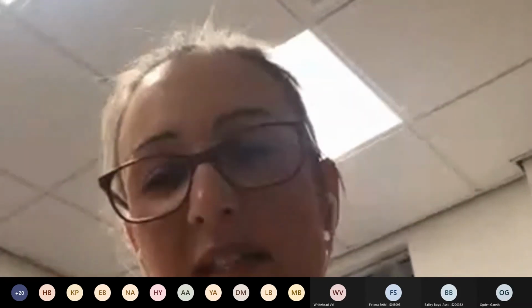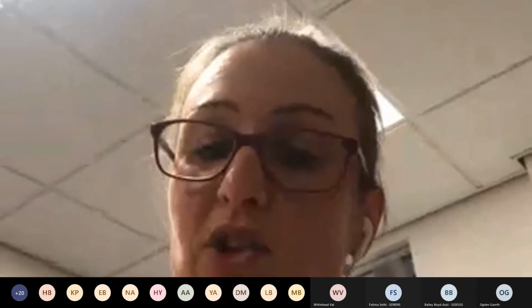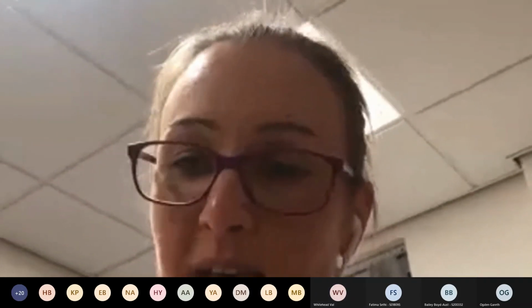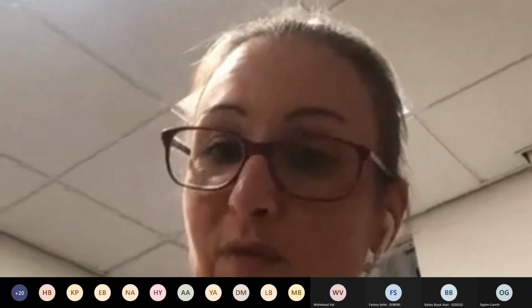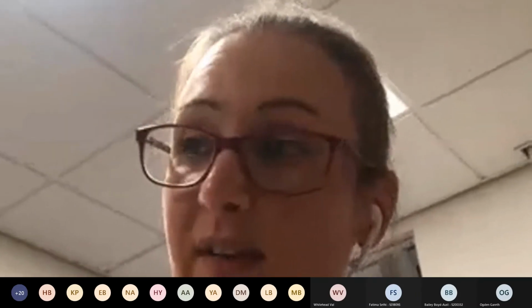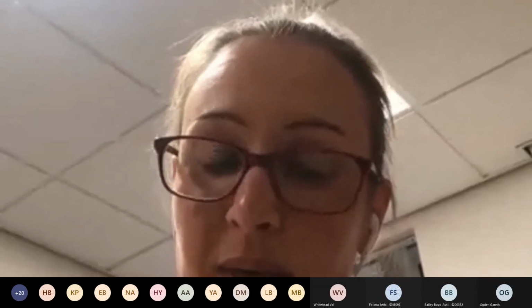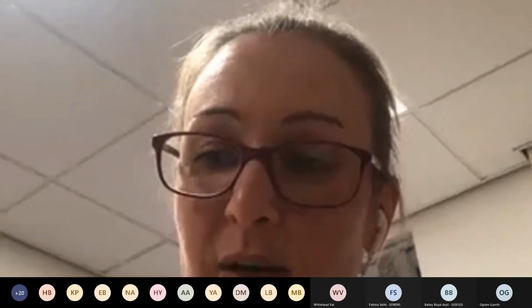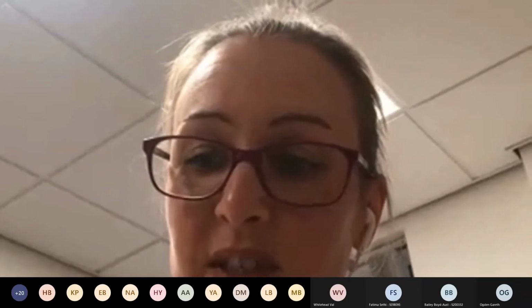The biomedical scientists who are on the benches and doing the bench work, they'll usually start off by getting all the culture plates out from the incubator from the day before. They'll sit and read. When I say read, what they're doing is examining the culture plates for different types of bacteria. They'll spend the morning doing various tests to identify what that bacteria is. And then the afternoon is usually spent testing those for antibiotic resistance.